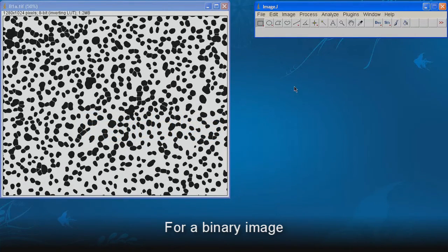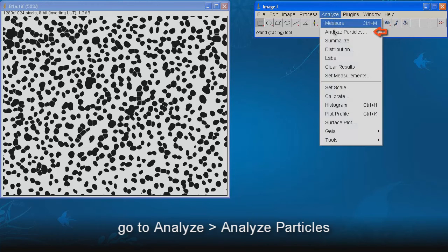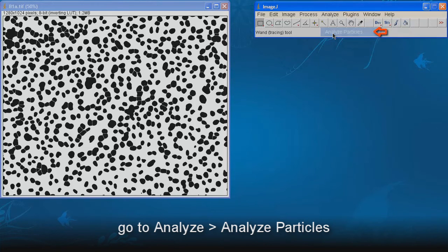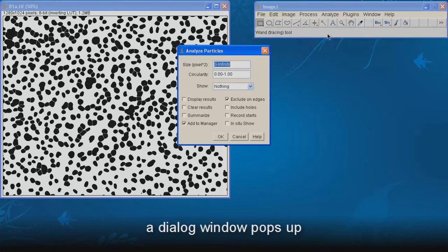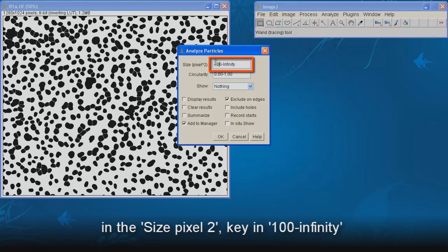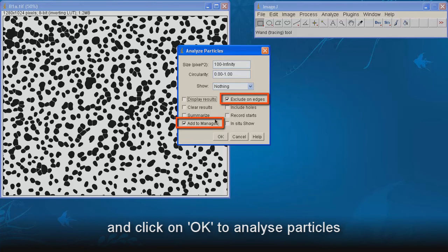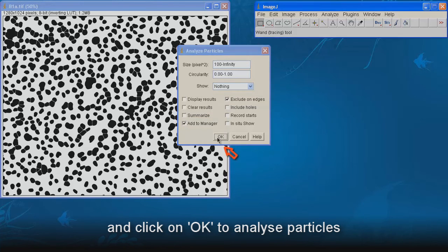For a binary image, go to Analyze, Analyze Particles. A dialog window pops up. In the size pixel square, key in 100 to infinity. Tick Exclude on Edges and Add to Manager. And click on OK to analyze particles.